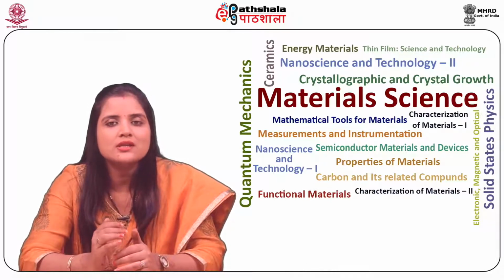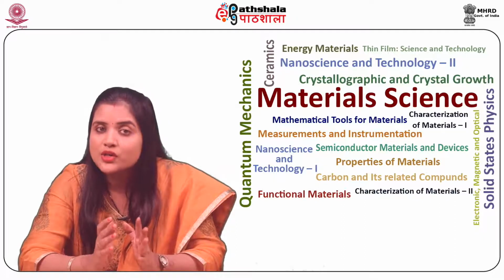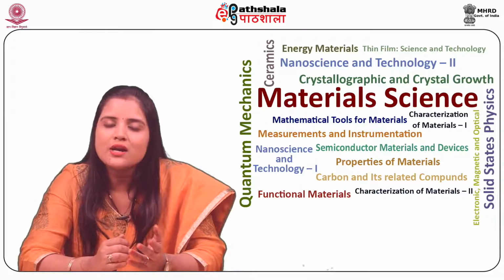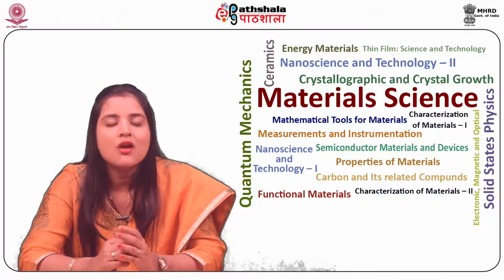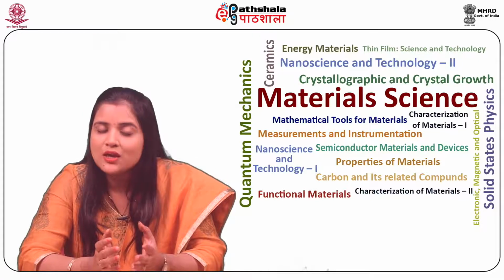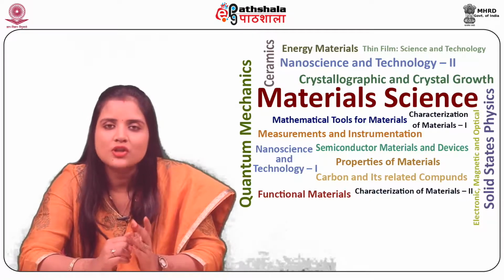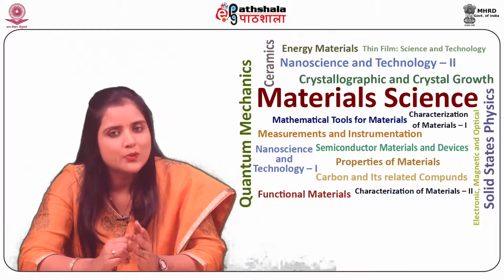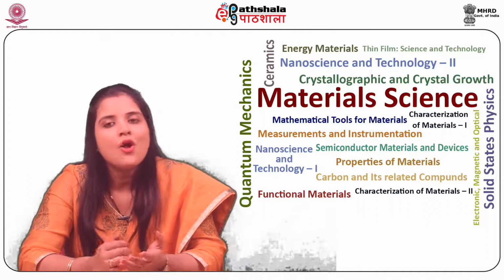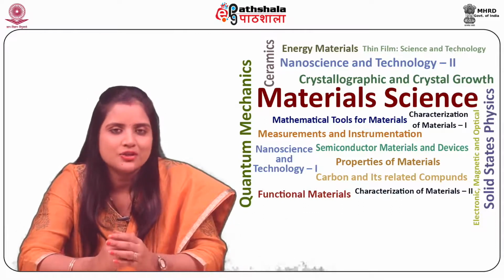It's an investigative method which is widely employed in elemental or chemical characterization of objects. The sample may be of any form, such as solid thin films, solid powder, liquid sample, or even a pellet.